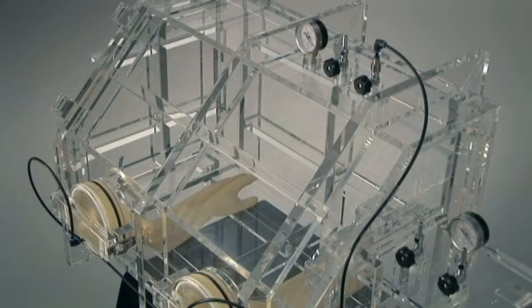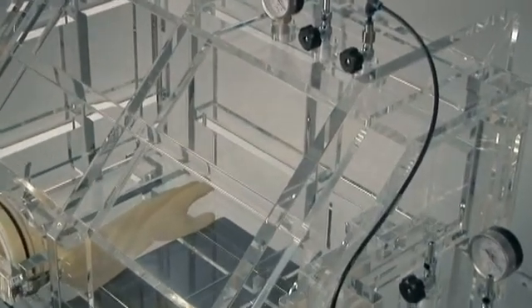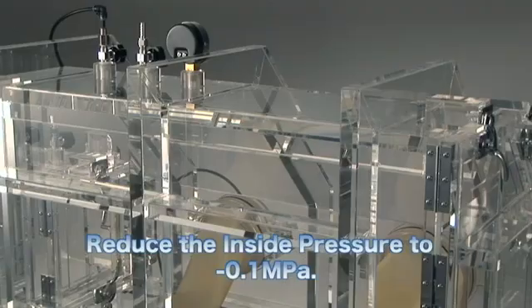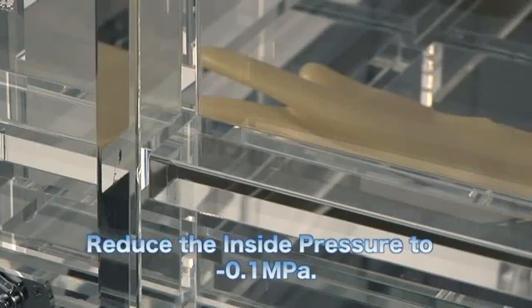In addition to each side's welding, reinforcing ribs are effectively put into the required parts. The structure is strong enough to withstand vacuum influence.